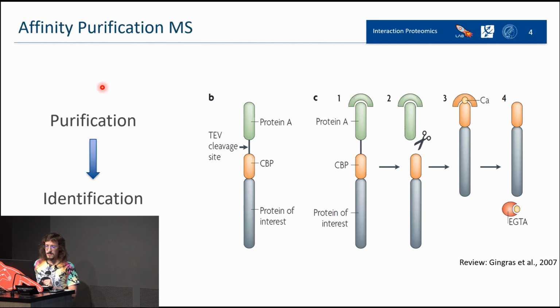There are different ways. One could be, for example, purification, and then identification. These are more wet lab techniques, so probably you know them better than I do. We have a protein A. We put here a binding protein, something that we know will surely bind with our protein of interest.